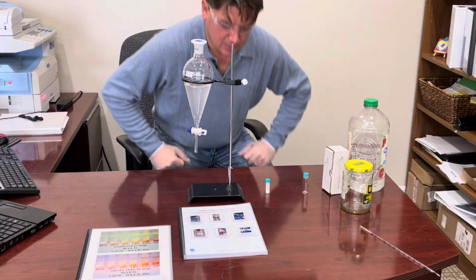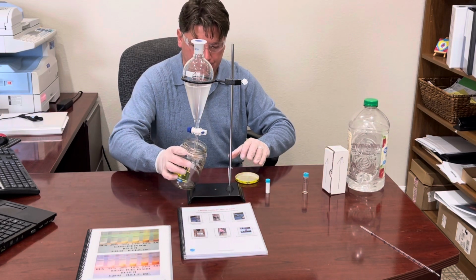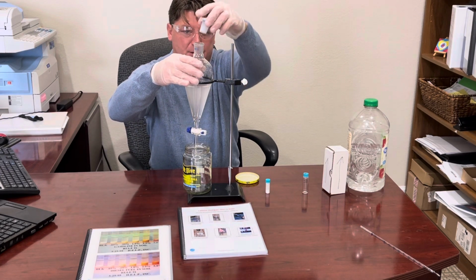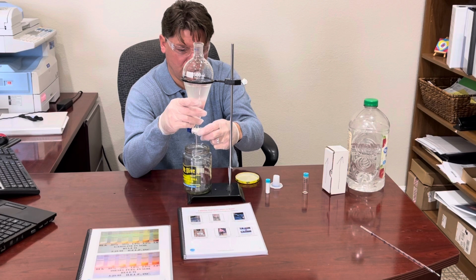So that being the case, let's decant off this water sample. Get rid of the water so we can utilize that extract. So we're going to release this water out.